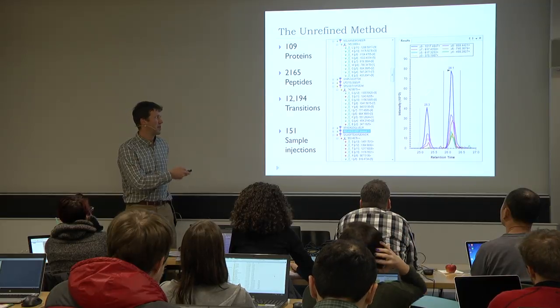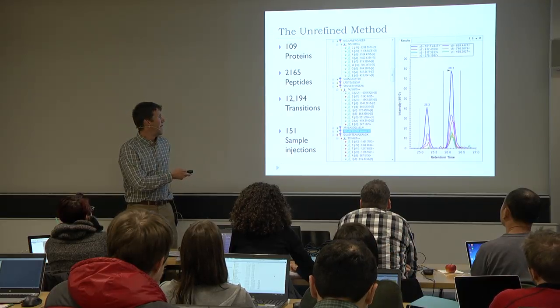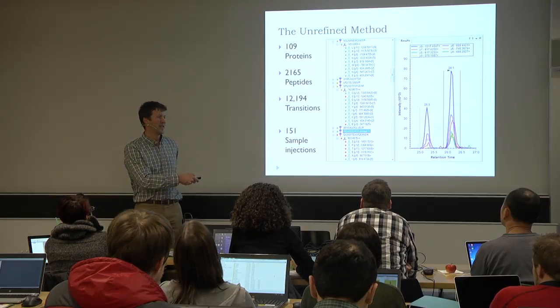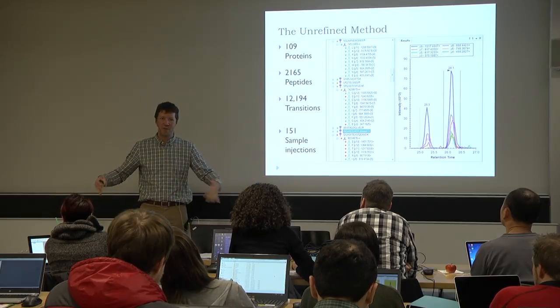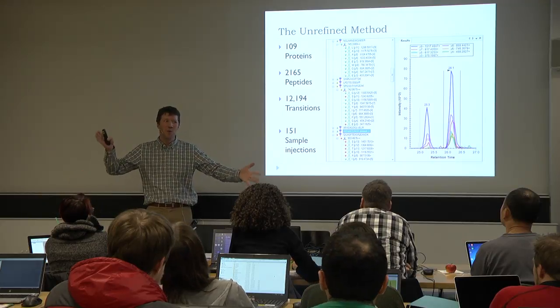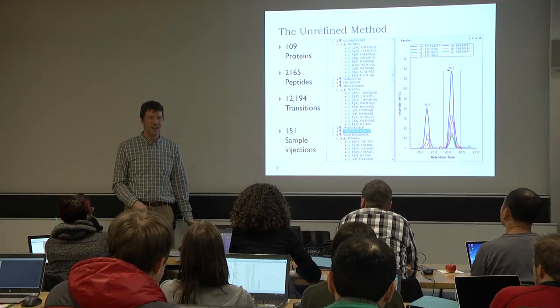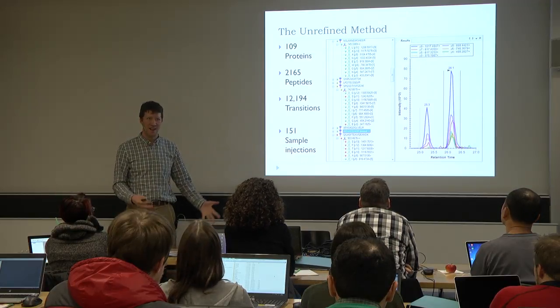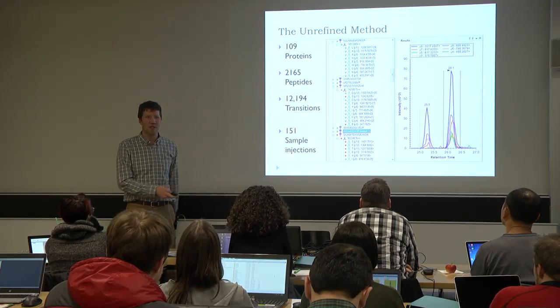And so some of them look like this. You're basically going to be looking at the results of these, the ones where we could find anything. We've been talking about how sometimes there are two things that you might be able to see. A lot of times there's nothing. You look at it and you go, well, I don't see anything that could be this peptide.